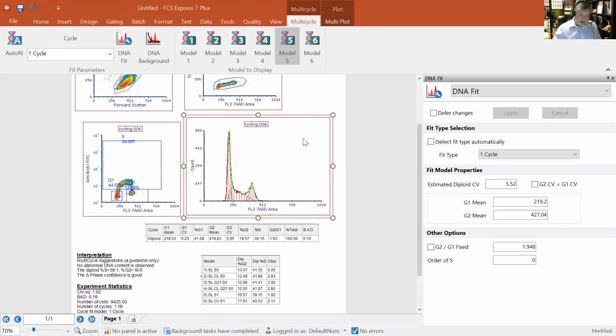And in the end, it's up to you as the researcher and as the scientist to make a determination of what model is fitting this data best. And you might be wondering, oh, well, this is supposed to be a modeling tool and it's supposed to tell me what works best, right? Well, it's making estimates based off your data. And again, in the end, you need to look at this. You can look at the chi-squared values, they give you some indication about what's fitting better.